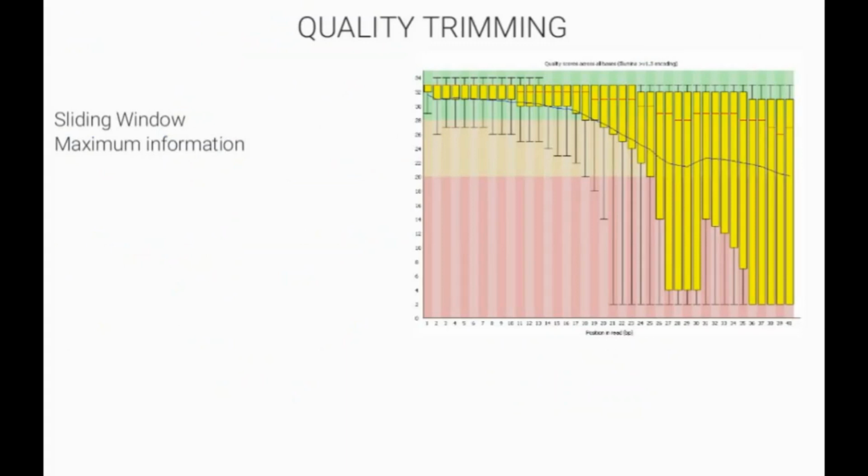Trimmomatic has two main quality filtering options. Both methods use the Illumina quality score, which you might find in a FASTQ file. This score for each base is used to determine whether or not to discard the 3' end of the read should the quality be low. With typical Illumina data, one would generally expect poorer quality towards the 3' end.